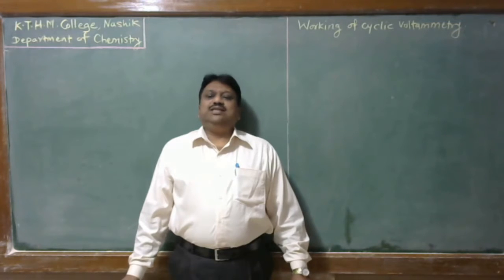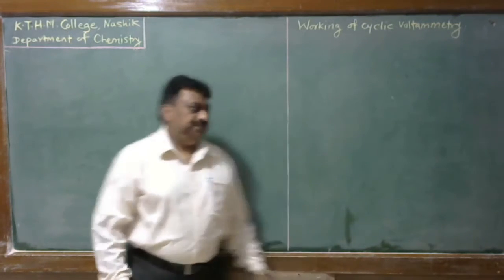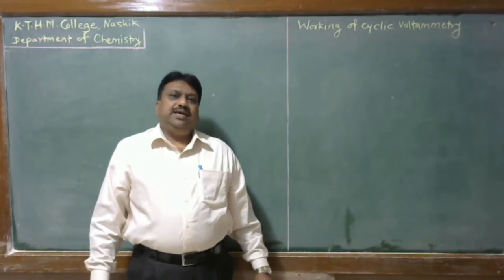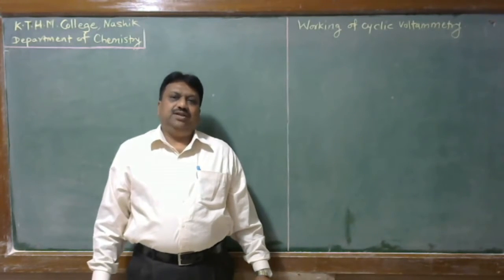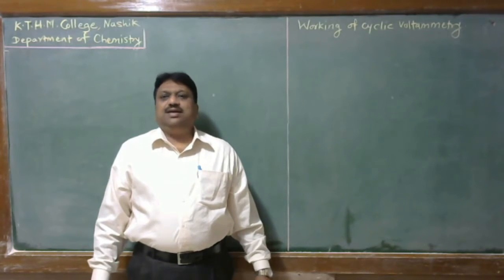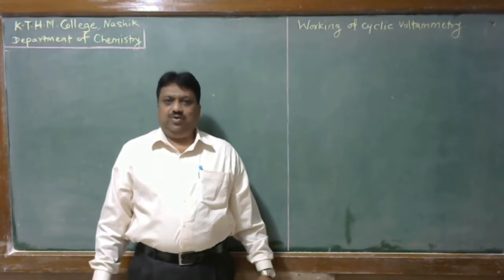Student, in today's lecture, we will discuss the working of cyclic voltammetry. Student, we know that cyclic voltammetry is an important tool of qualitative and quantitative analysis in which cycling of potential to the working electrode is carried out and resulting current is measured under diffusion mass transfer phenomenon.